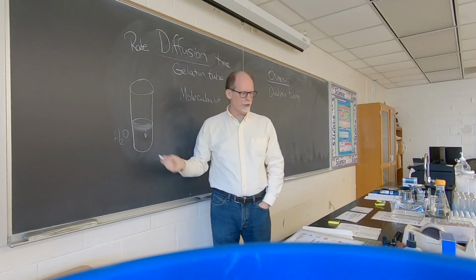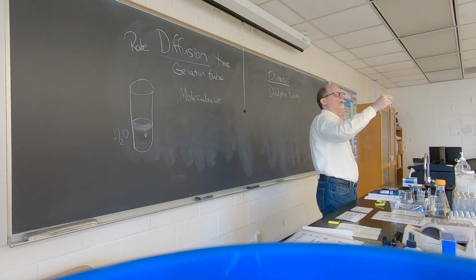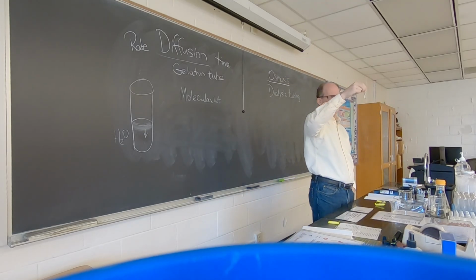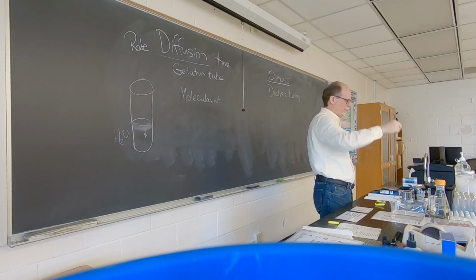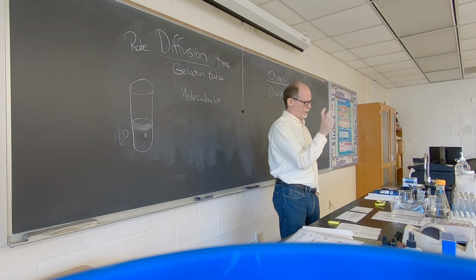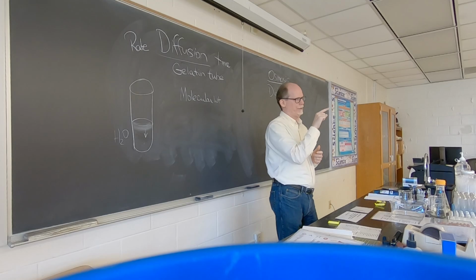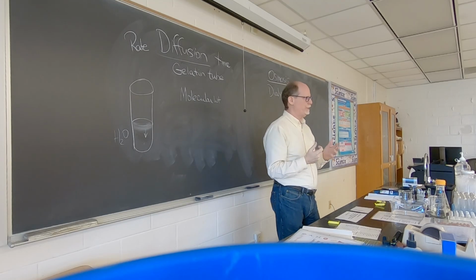When you look at this gelatin tube, it looks pretty solid, and you would say, well, nothing's moving in there, right? I mean, just by looking at it. But everything is vibrating, the molecules are vibrating, and sometimes they're moving up and down, and they're actually moving from a location, but not much.